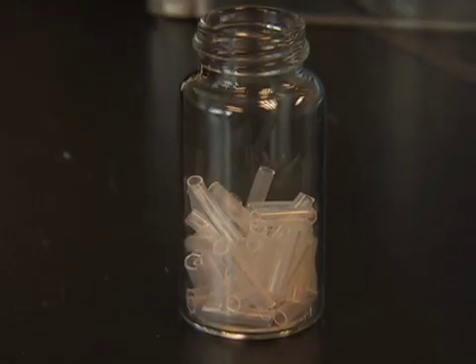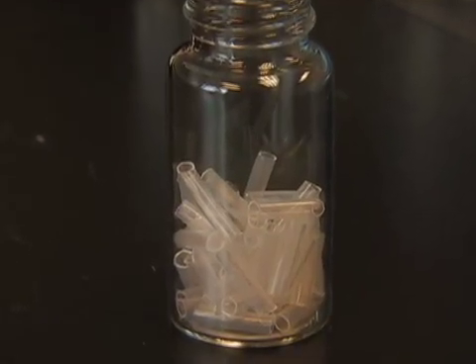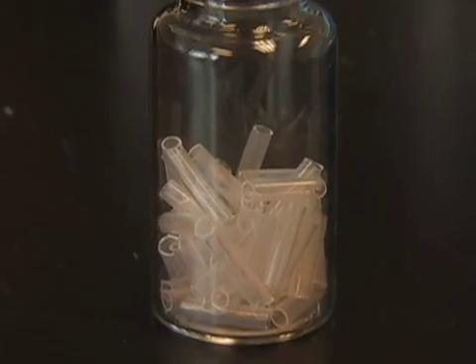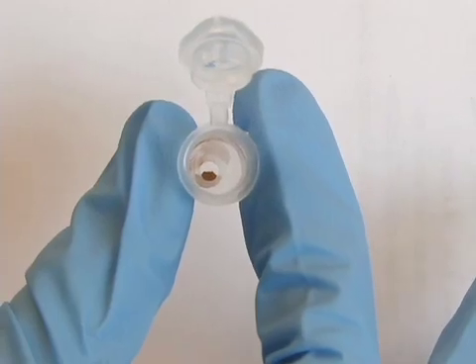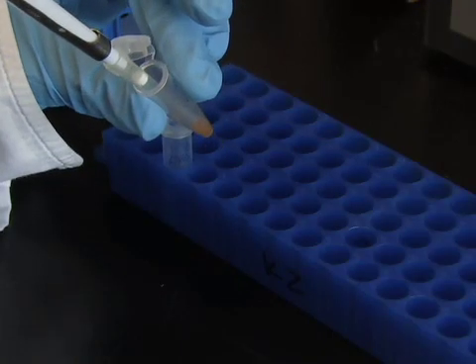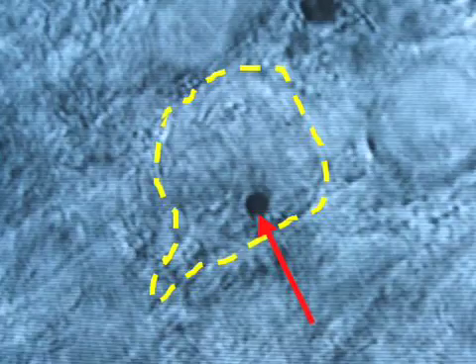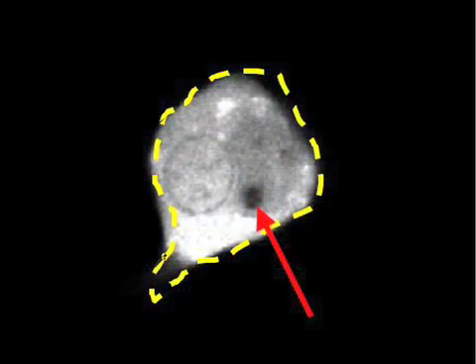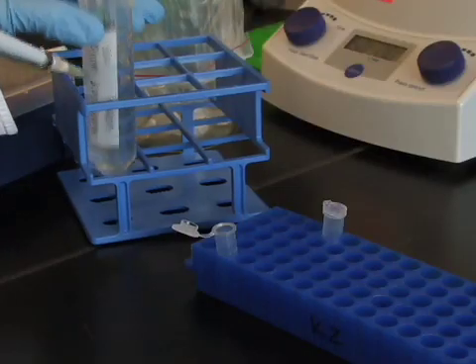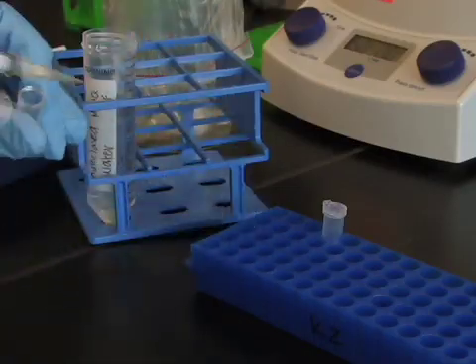Before we are ready to transfect, we first need to prepare the DNA coated bullets. This will entail coating 1.6 micron gold particles with the DNA plasmid to be transfected. During shooting, an individual gold particle will act as the bullet that will penetrate the cell leading to transfection. So first we need to prepare the DNA to be transfected.